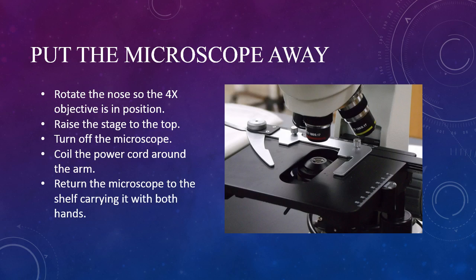Raise the stage. Turn off and unplug the microscope, then coil the cord around the frame. If your microscope has a dust cover, replace the cover, then return the microscope to the shelf, carrying it with both hands — one on the frame and one under the base.